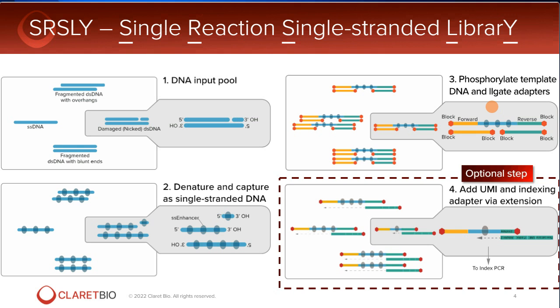The forward is a fancy name for the P5 TruSeq sequence of adapters, and the reverse is a fancy name for the P7 TruSeq Illumina adapter. There are certain differences of these adapters that separate them from standard double-stranded Y or hairpin adapters. And mainly that is that there is a 7 base pair random splint portion on this duplex adapter.